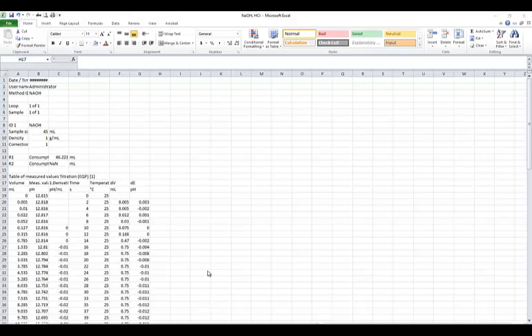Welcome to Dr. Kate's video on titration curves and derivative plots for the Analytical Chem 1 lab. So I have here a typical output from one of our auto titrators, and I'd like to thank Alexandra for supplying me with this file so I could use real data for doing this video.